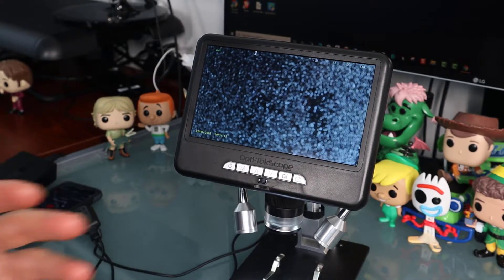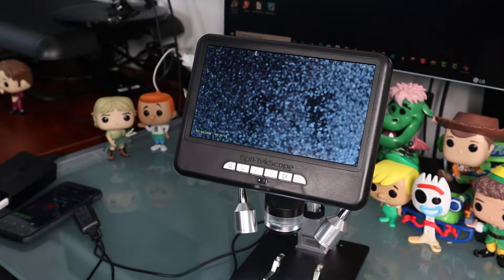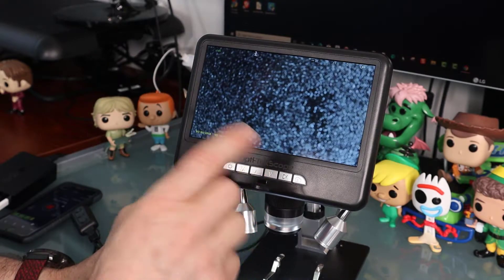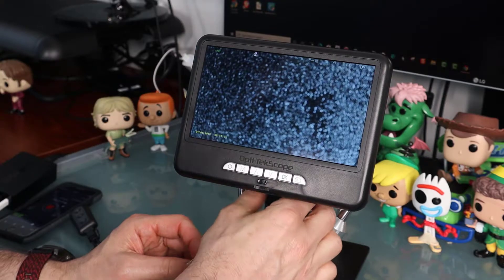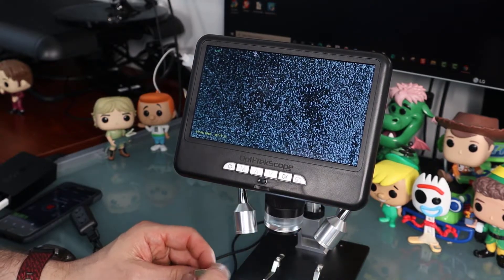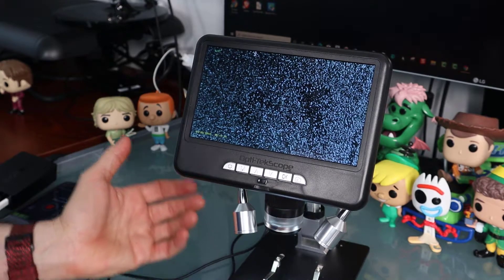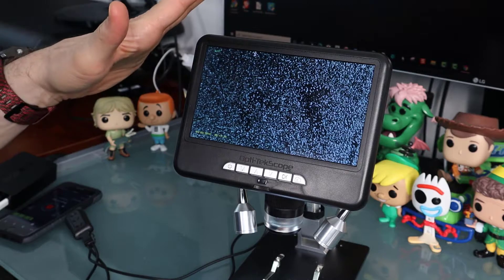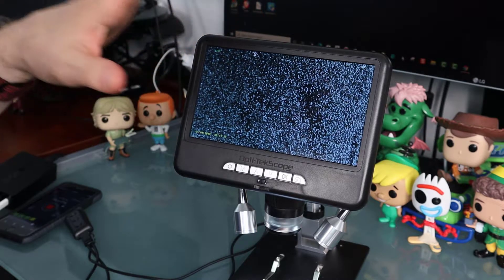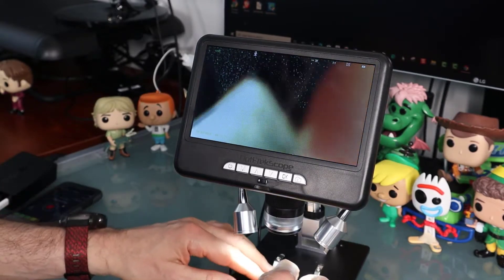Today we're going to take just a few different types of items so we can have some fun and dive in. It's a hundred times zoom capable. We've got the seven inch screen, so it's really nice and provides a nice picture. You don't need a micro SD card if you're just looking at it. If you do want a micro SD card, you can save files and video to your computer.